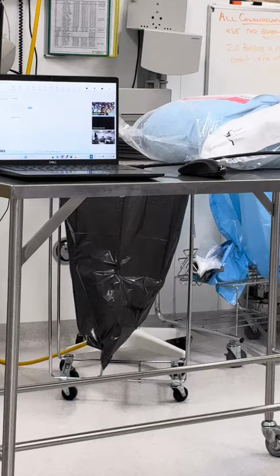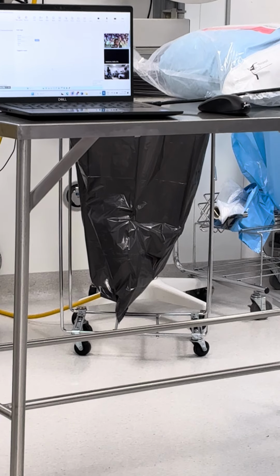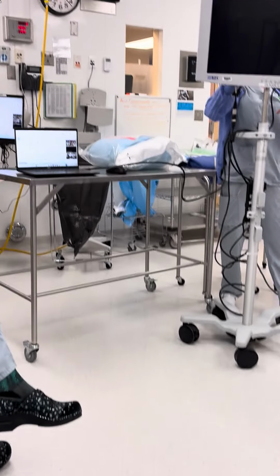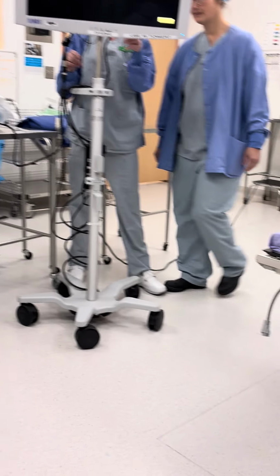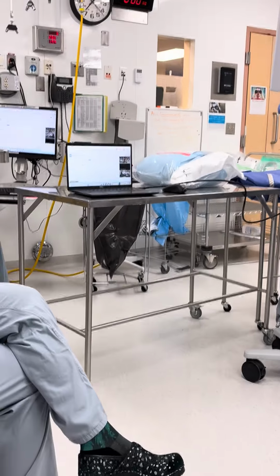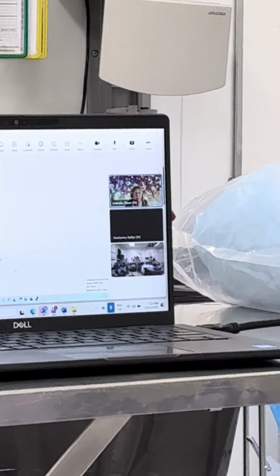My workstation is a little bit different than yours, but when you log into Windows, you're logging into IHAOR, right? At first, into Windows. Yeah, it's not logged into IHAOR. Okay, and then there should be an SPM icon, a shortcut on your desktop. And so I've already opened it up.